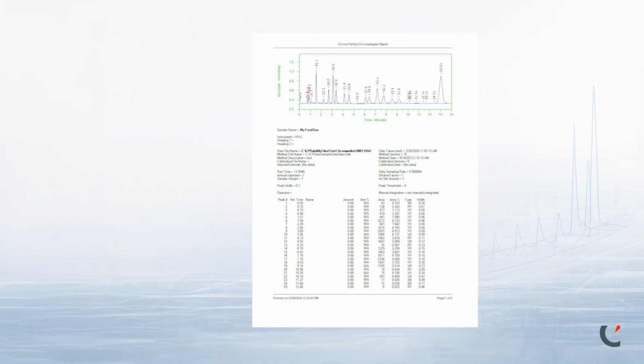Report generation. The Attest method is configured to produce a long-form report. A report will only print if a default printer is configured and available. If no printer is available, acquisition is still complete and data is still saved correctly.